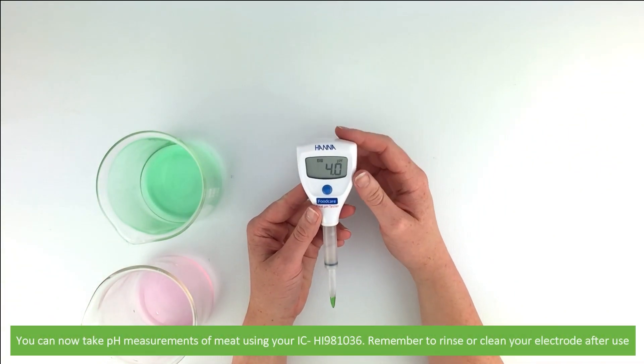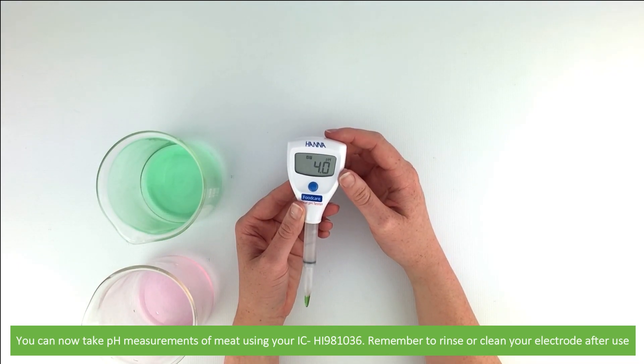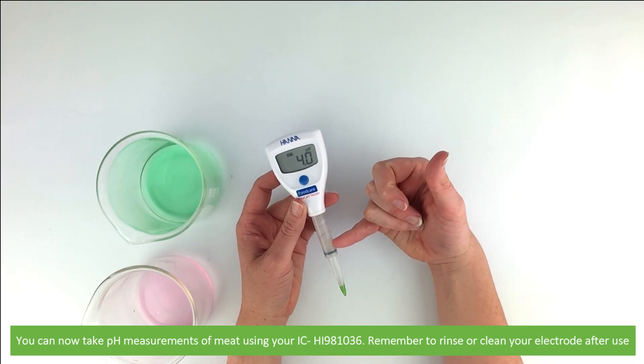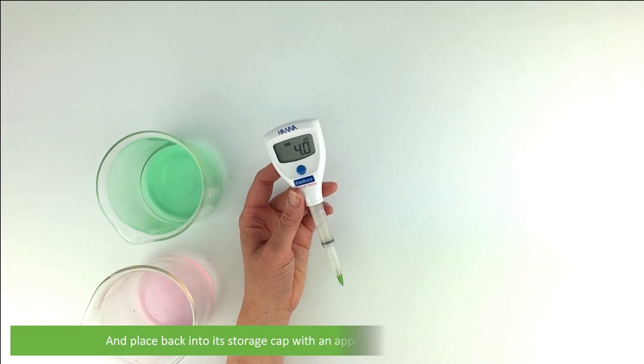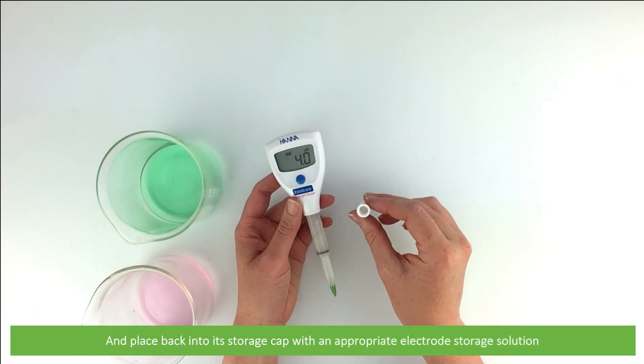You can now take pH measurements using your IC-HI-981036. Remember to rinse or clean your electrode after use, and place it back into its storage cap with appropriate storage solution.